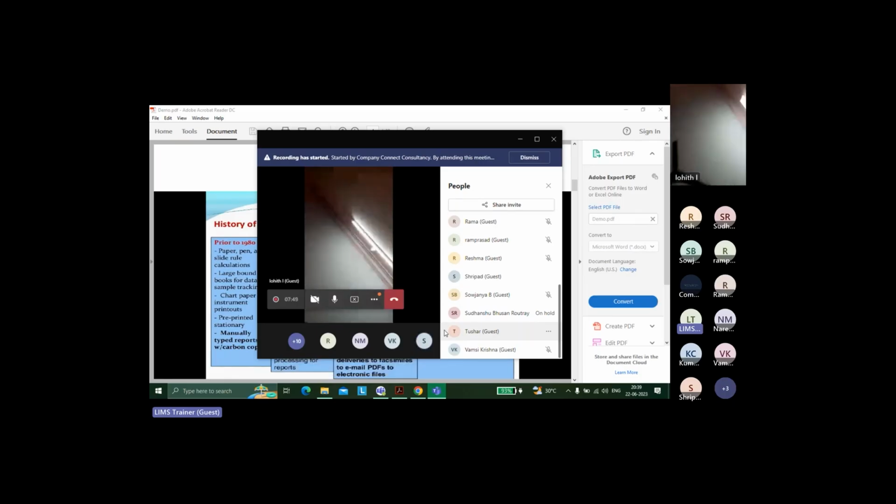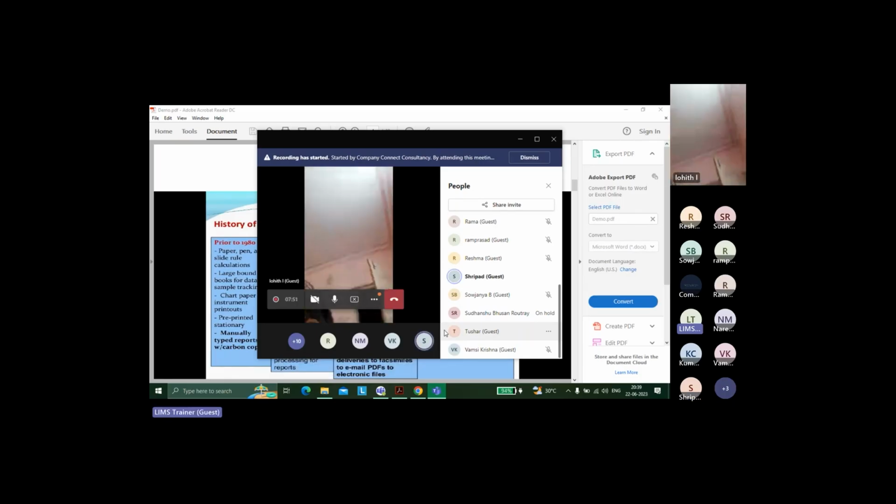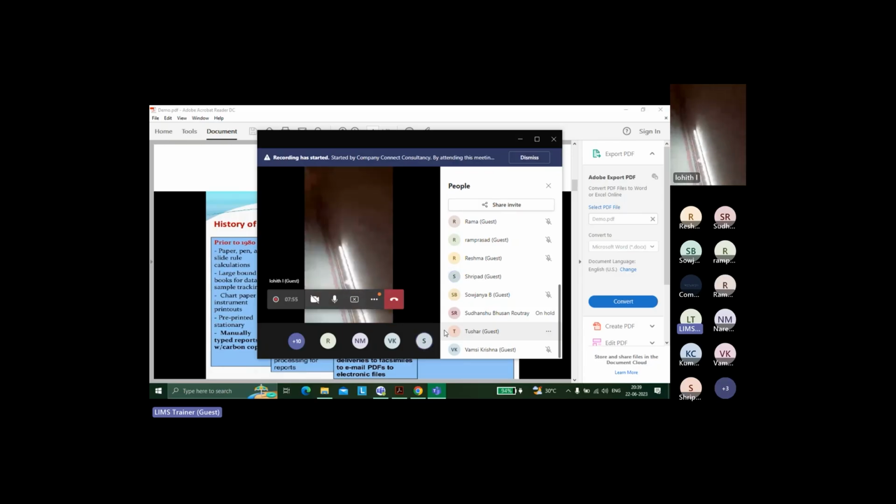If you take the example of LIMS, for example LabWare LIMS, you can write LIMS Basic code, you can write the formula, and the analyst will just enter the values. Earlier that used to be pen and paper; you needed a calculator and had to calculate everything, or use an Excel sheet. Now you don't even need to type the formula. Maybe you know what the formula is, but it is already typed and already validated. You just enter the values.